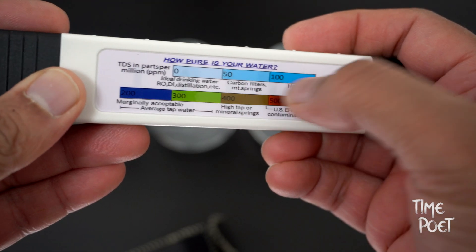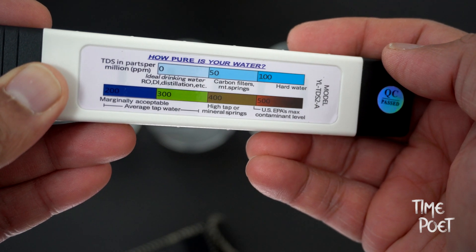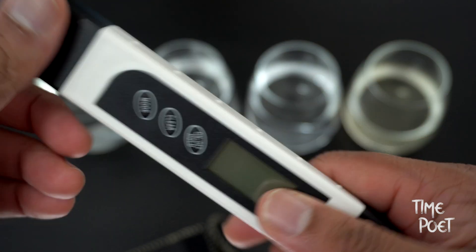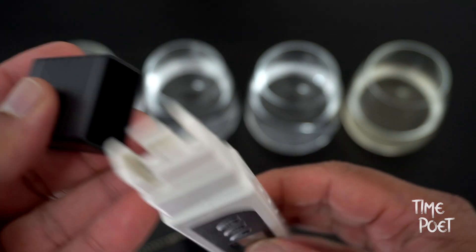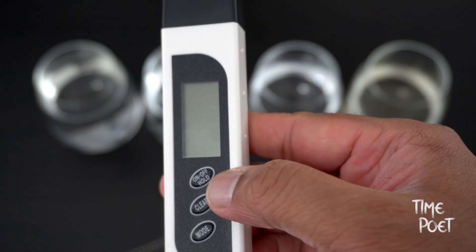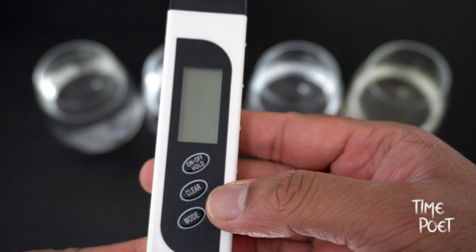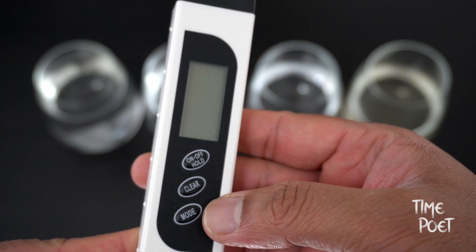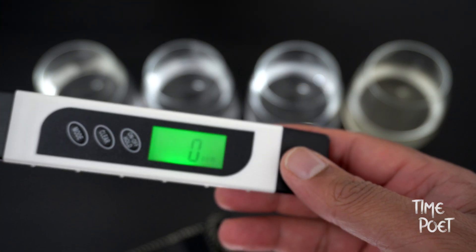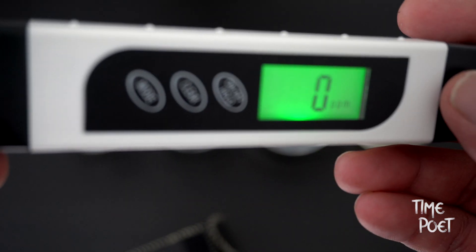Total dissolved solids are measured in parts per million. Zero to fifty is considered to be the ideal drinking water range, but we recommend you check your local council and health department website for acceptable levels and more details. The device has three different buttons: one for mode, one to clear the reading, and one to switch on and off. It has a display with two colors — green and red — that changes color based on the value.